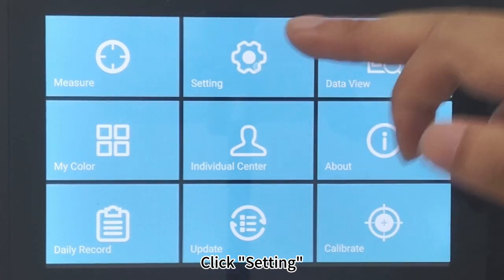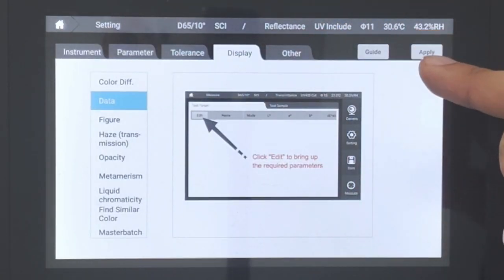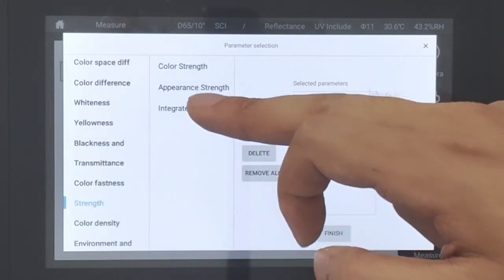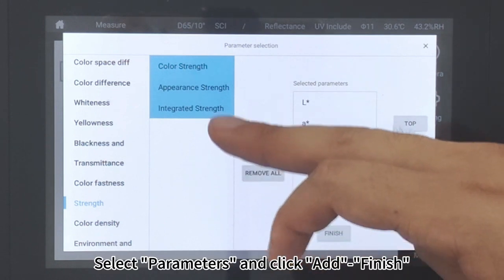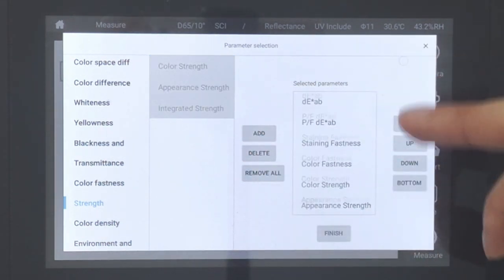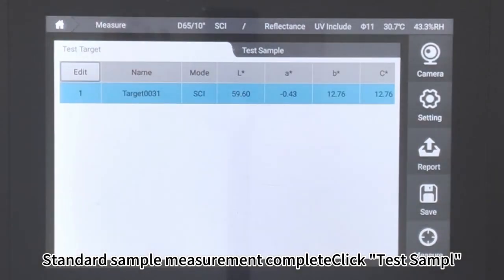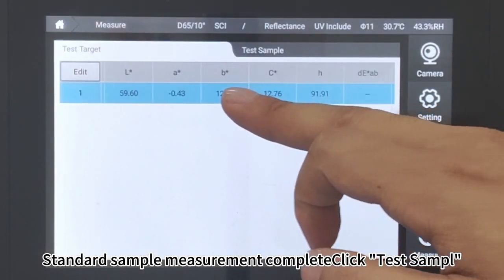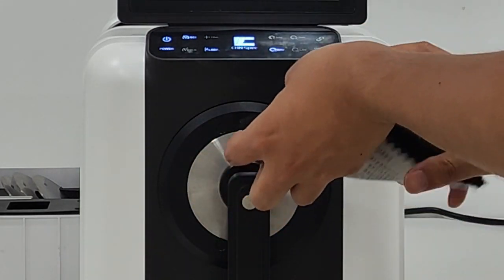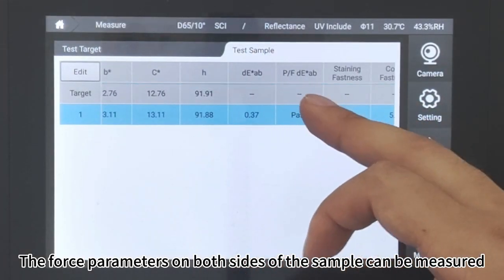Reflection Mode. How to measure strength: Click Setting, then click Display Data Apply. Click Edit, then click Strength. Select parameters and click Add, then click Finish. Clamp the sample to the measuring port and click Measure. Standard sample measurement complete — click Test Sample. The other side of the sample is then measured. Click Measure. The strength parameters on both sides of the sample can be measured.